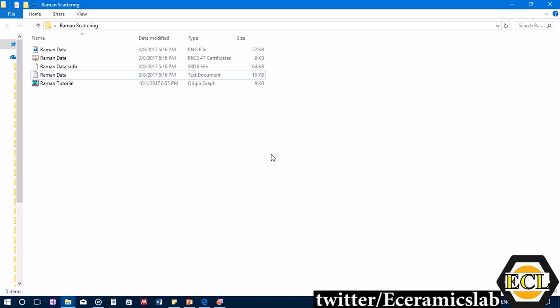We'll list out the requirements for the tutorial. You will need Origin software — in this case Origin 9.0 — and Raman scattering data with background correction. The background correction is very important because if the data is not background-corrected, the values obtained will not be accurate.